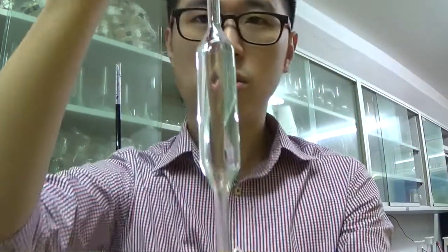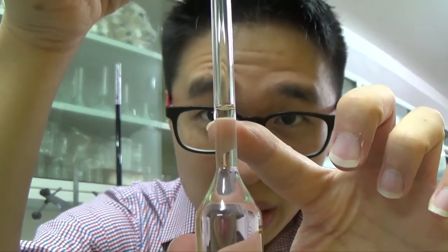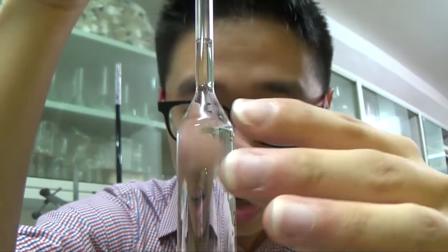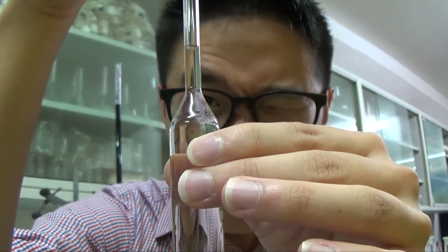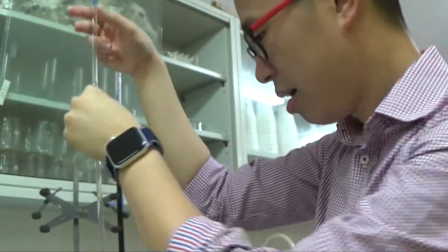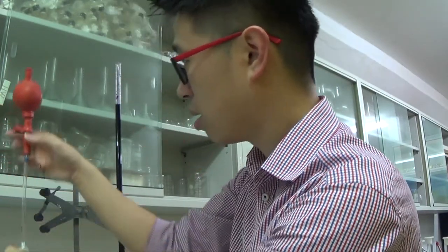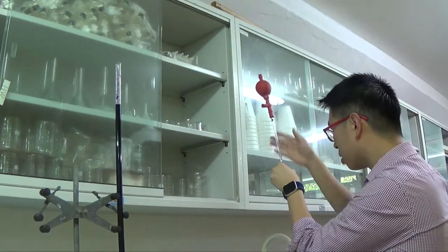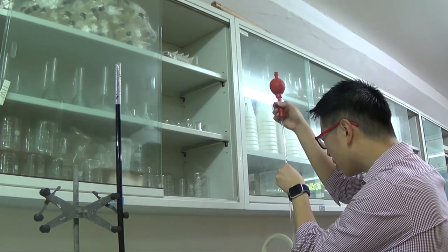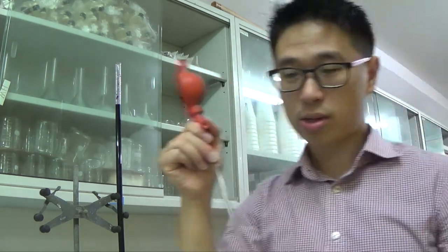And this one is colorless solution, so you can read at eye level. I hope you can see, it's not very clear, but just below the meniscus, the meniscus is like that, slightly curved. So, okay, my solution is getting worse and worse. Anyway, my first one is going to be a rough titration. So this is probably as good as it gets. Maybe I'll take in some more. Okay, so suck a bit more. And then eject. So that's 25.0. The first one is always a rough titration.